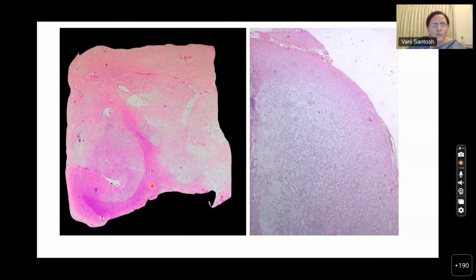the tissue. And what you can see here, this is the gray matter, and what you can see here is the white matter. And in the gray matter, I hope you can see all these multiple pale nodules, cortical nodules. They're in the gray matter. White matter is unaffected. It is spared. See, most of the diffuse gliomas, they arise in the white matter and then they spread to the gray matter. But here you can see that it is cortically based. It is in the gray matter and the white matter is spared.